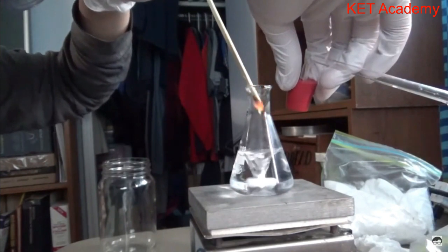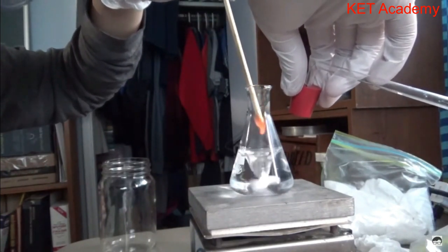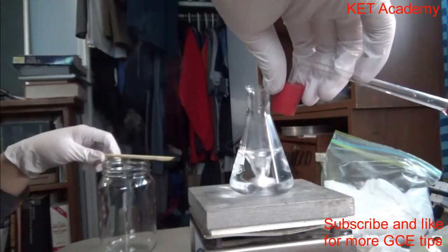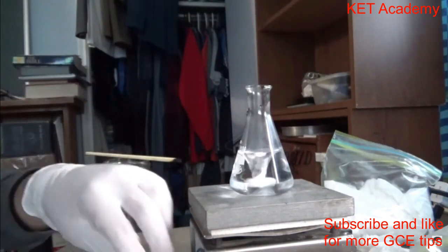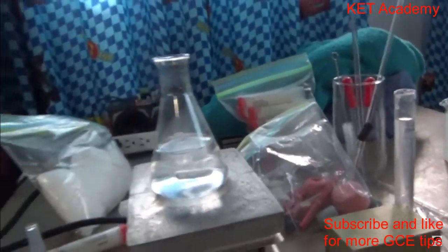Oh, that's wonderful. Look at that. Stick that in a little bit further. I don't want to put it in the solution, and it just went out. It just went out. Which means, ladies and gentlemen, that is good old classic carbon dioxide. So that basically confirms my hypothesis.